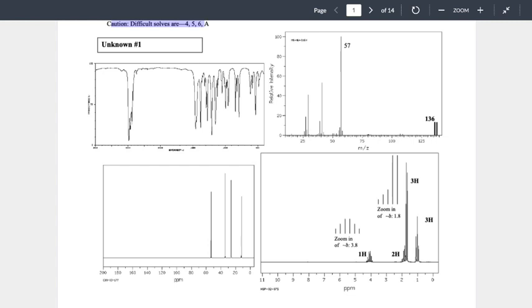What's that? Okay, so it gives us information about bonds, yeah, but why start with that? Why not start with HNMR that gives us a whole lot more structural information? It's a pretty straightforward answer. It's easier and it's faster. Your interpretation of the IR should go incredibly quickly. So quick, in fact, that it makes sense just to get that information.